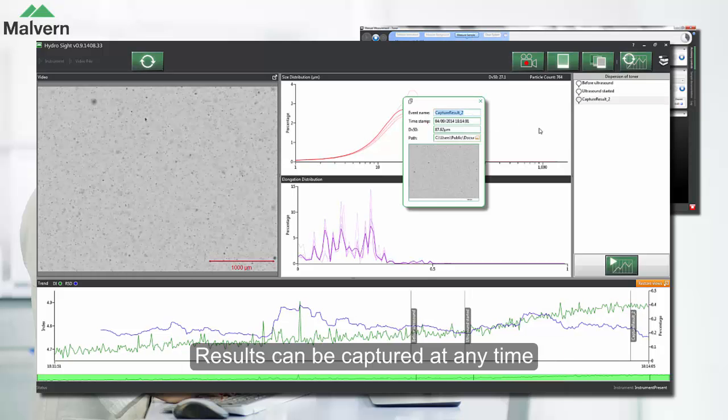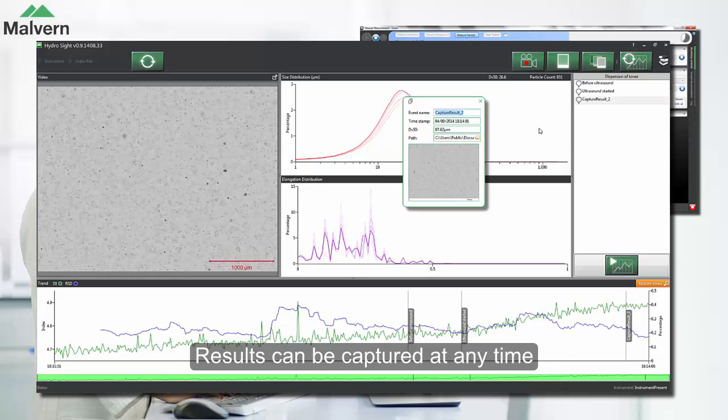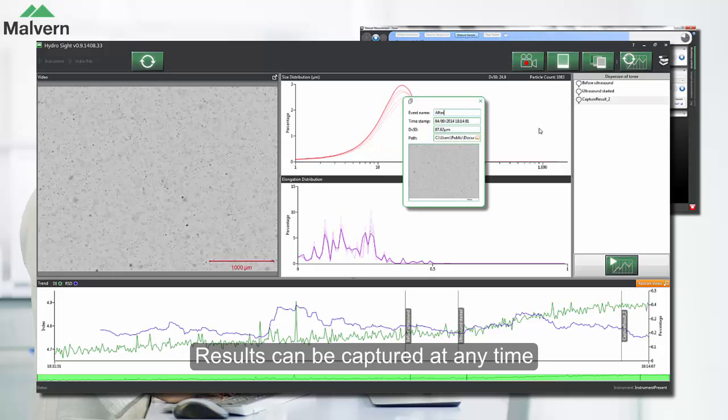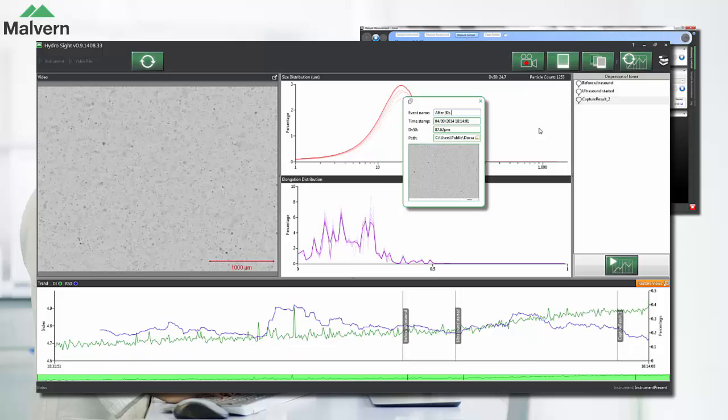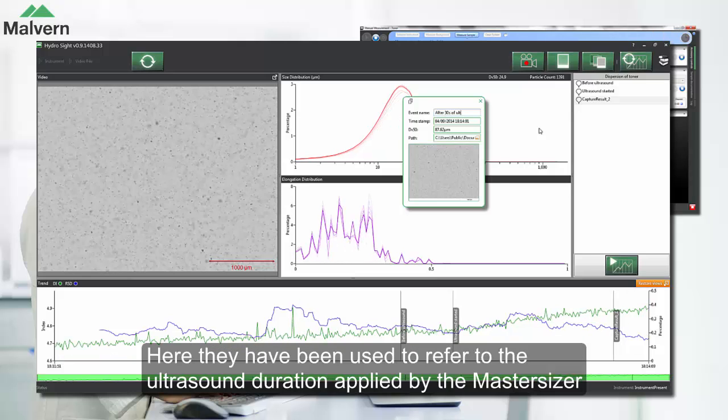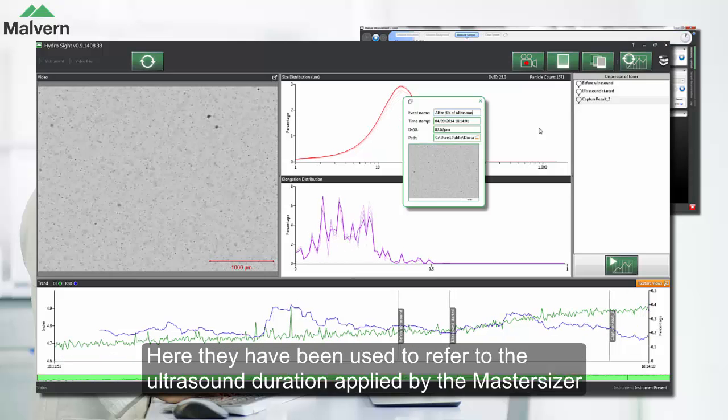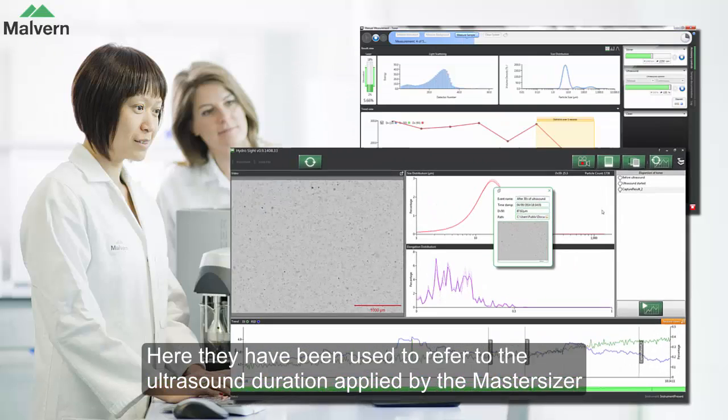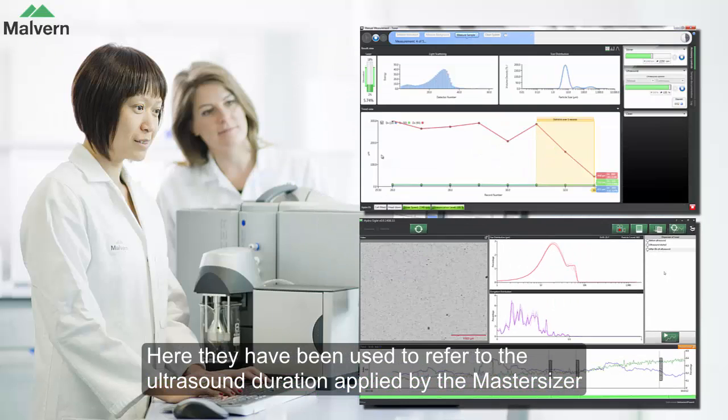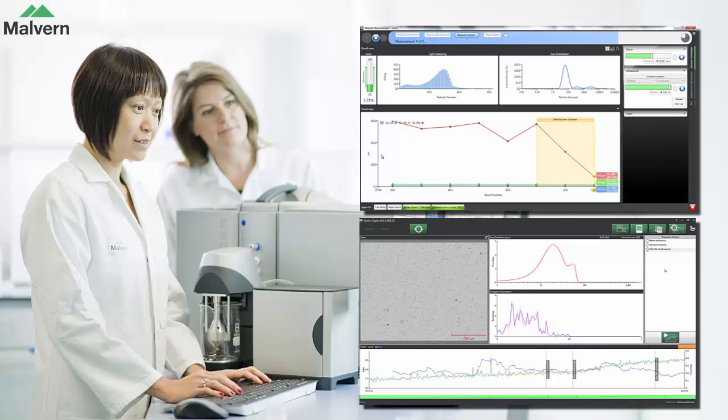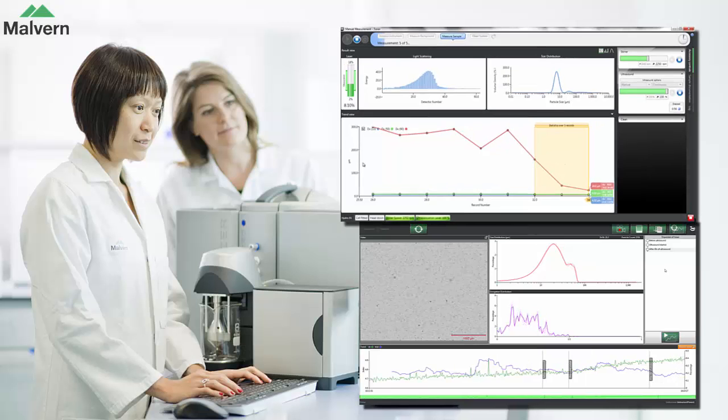We can capture a result at any time, and here it's been renamed to reflect the duration of ultrasound that's been applied to the sample. Again, this will be useful when we come back to review the dispersion index trend.